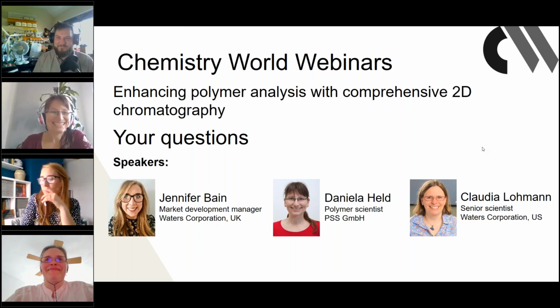That is a really nice question. I like that one. Actually, we are already kind of 3D, because we have only shared with you the contour plots, which are really good to analyze data and to get numerical results. The colors also have a meaning in these contour plots, and they reflect the concentration of each of the peaks that we have seen. So actually, we are kind of 3D already, and you can make some nice pictures where you show the peaks with their different heights.